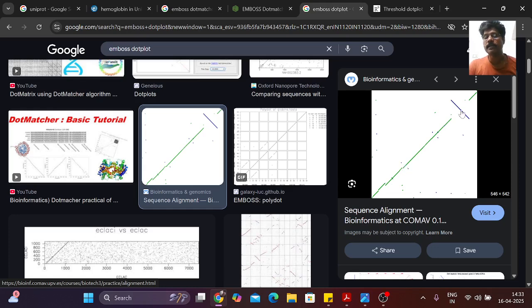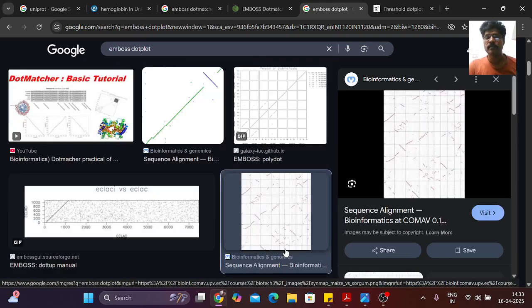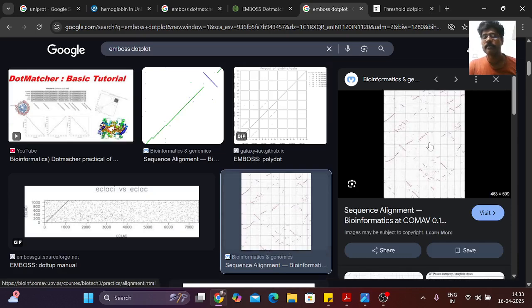And here see that there is a gap in between, and this base up to this one. And what happens, there is a line coming as an anti-diagonal, right? So you should know what it denotes. These are all things you have to discuss in the result. And there is so much noise in this picture.